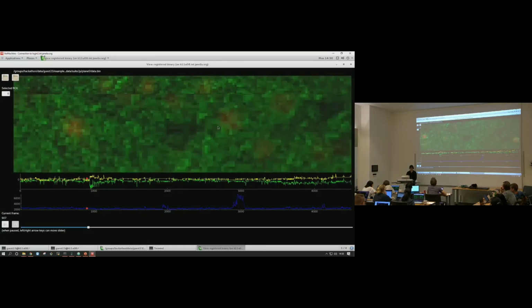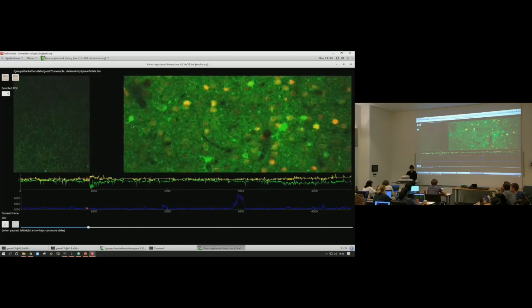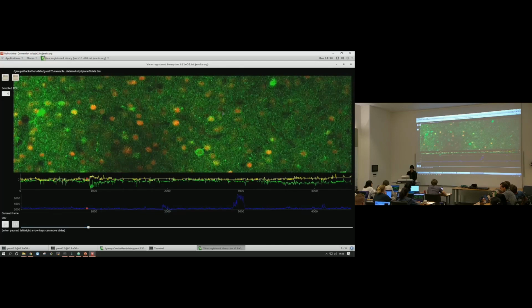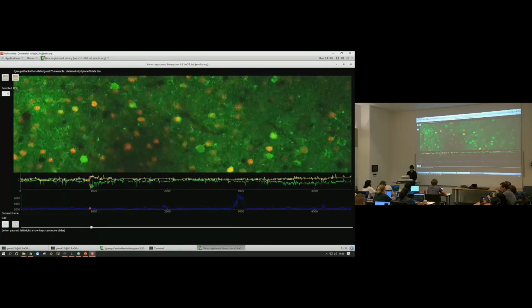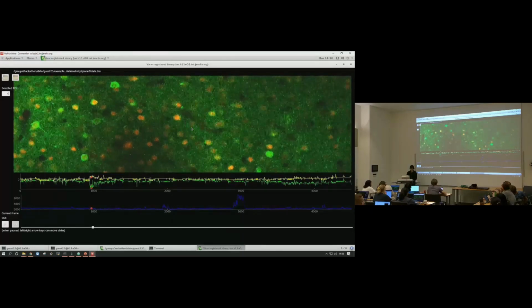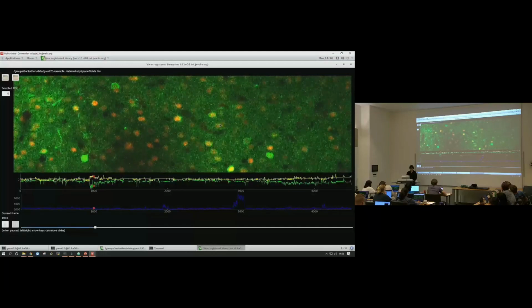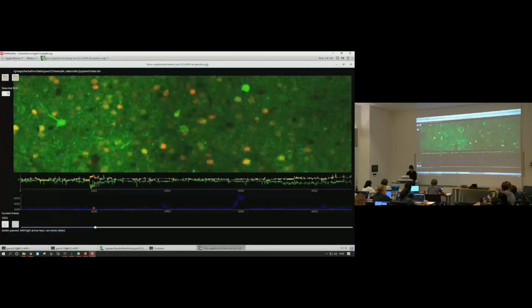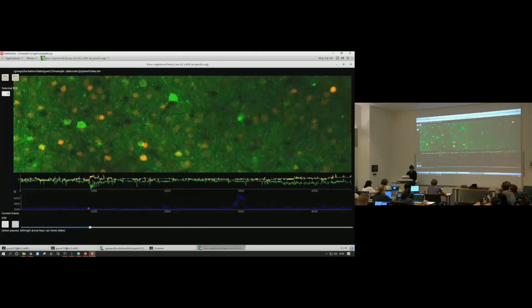So let's zoom in on the corrected view and see that things look okay around here. All right, let's do the uncorrected view first. Let's see what happens. You can clearly see things moving around. There is some lag from my machine, but you can see things moving. And then let's go over to the same area with these red dots. Let's go back. Let's start over.